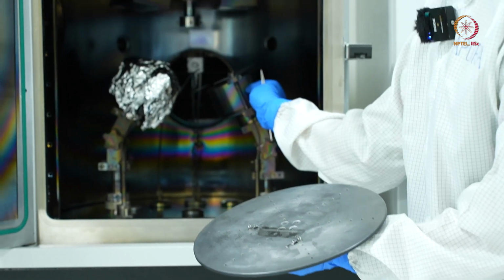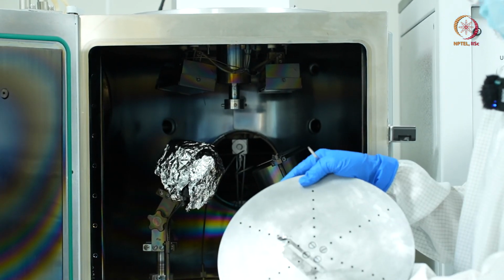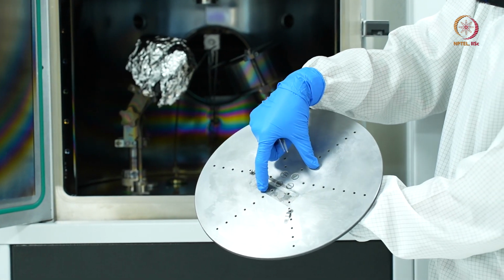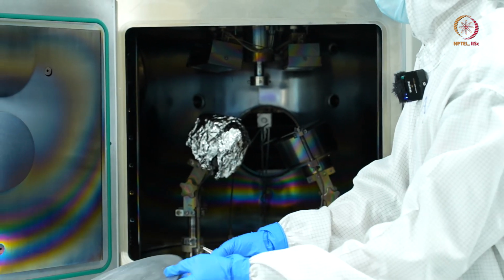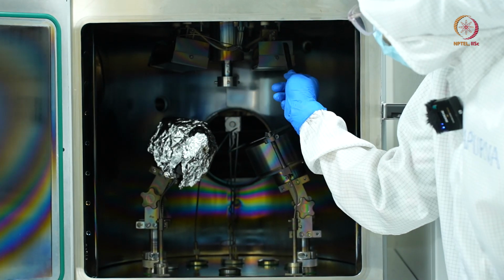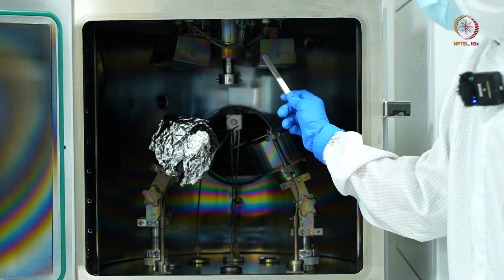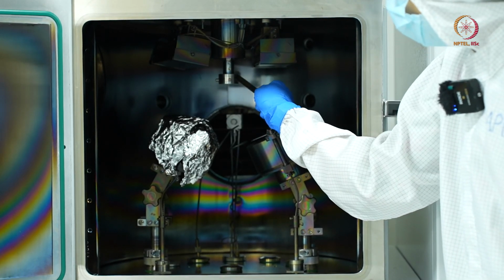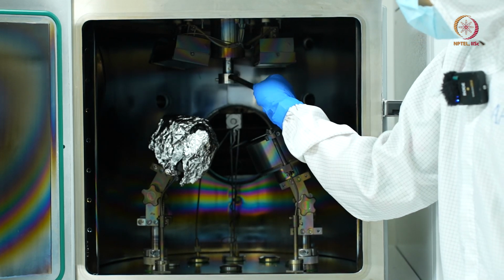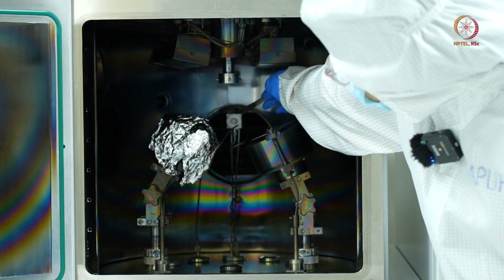As you can see, this magnetron is at some angle, so the ideal position to keep the wafer or the sample is at the center of the chuck. Now these are the halogen lamps for substrate heating. Using radiation heating, they will heat the substrate. This is the spindle on which to place the substrate holder, and it will rotate as and when required.